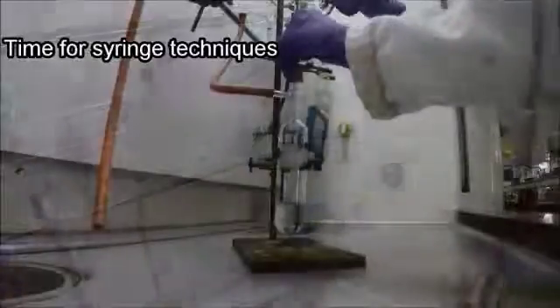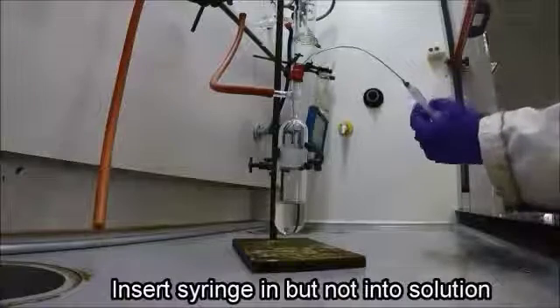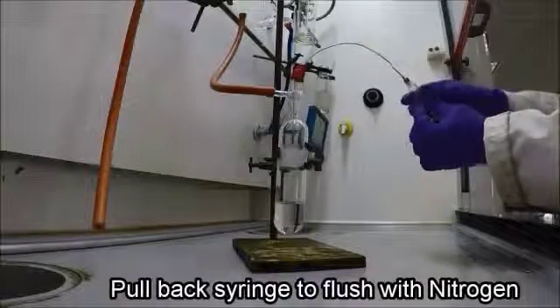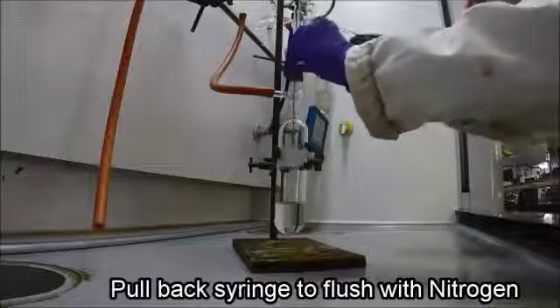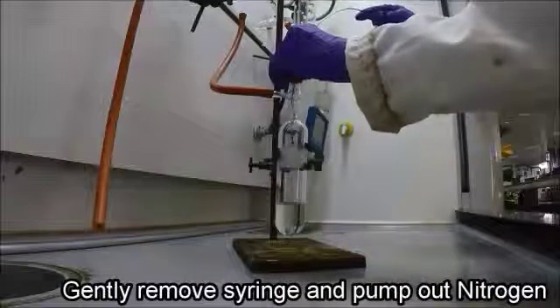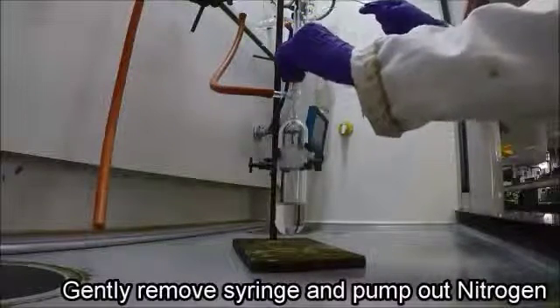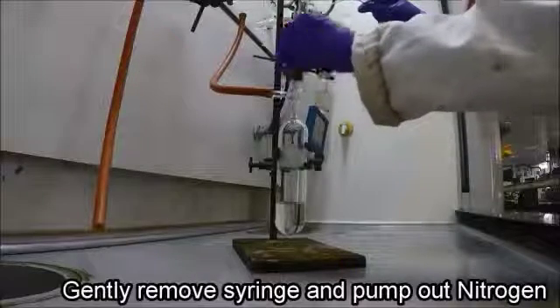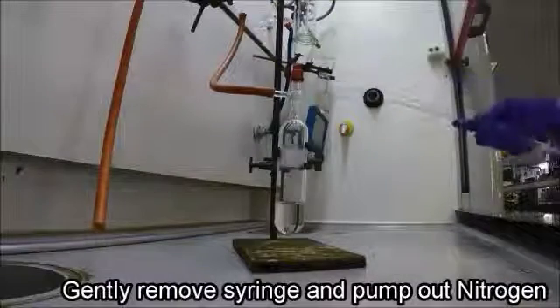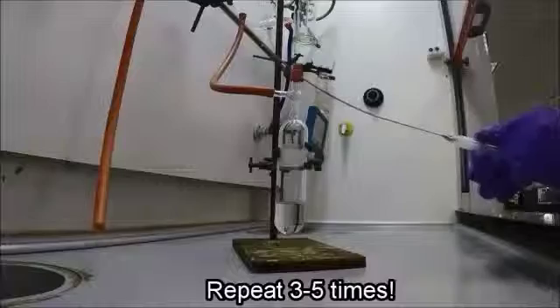Once the flask has been pumped with nitrogen, we can now work on syringe techniques. Insert the syringe into the flask but not into the solution, then pull back the syringe to suck in some nitrogen. Remove the syringe gently from the flask and pump out the nitrogen. This flushes the syringe and makes sure there is inert nitrogen gas throughout. It's important to repeat this step about three to five times.